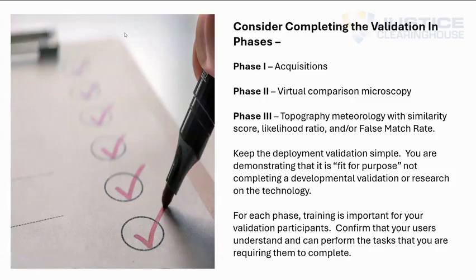Keep in mind that the deployment validation needs to be simple. You're just demonstrating that it's fit for purpose, not completing a developmental validation or research on the technology, unless it's not available. And then you might have to do a little bit of that, but the validation just needs to show that it's fit for purpose and that it provides results as intended.